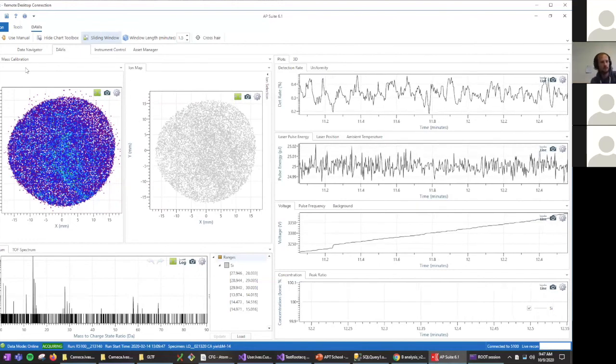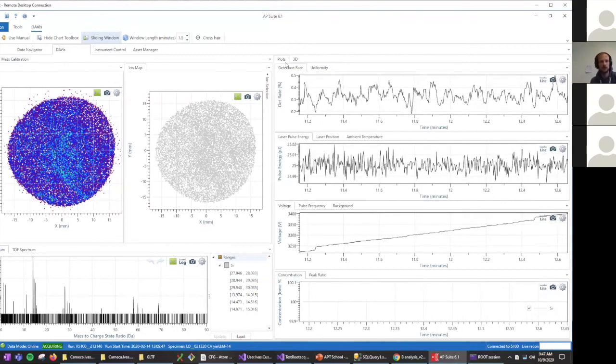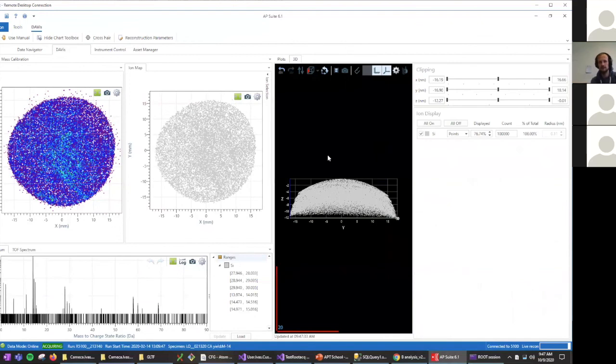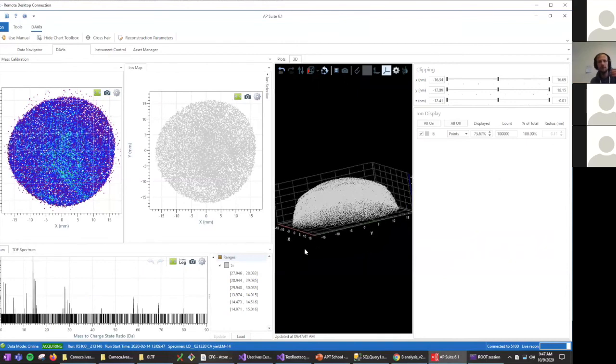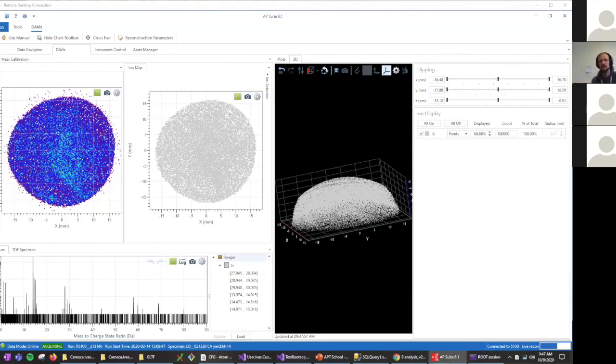Something which is open, then people could pass this information and supplement it alongside the hashed data set on a repository. That will never be complete, and I think it's also not so problematic that it's not complete, but it will be much more documented than it is right now, where you just have basically a set of figures, a paper in a journal that most often I cannot even any longer read, and data sets that I don't have access to, or most of us don't have access to. And I think if we go step by step and incrementally, this would be most useful for the community. Looks like a nice reconstruction that you've got running there.